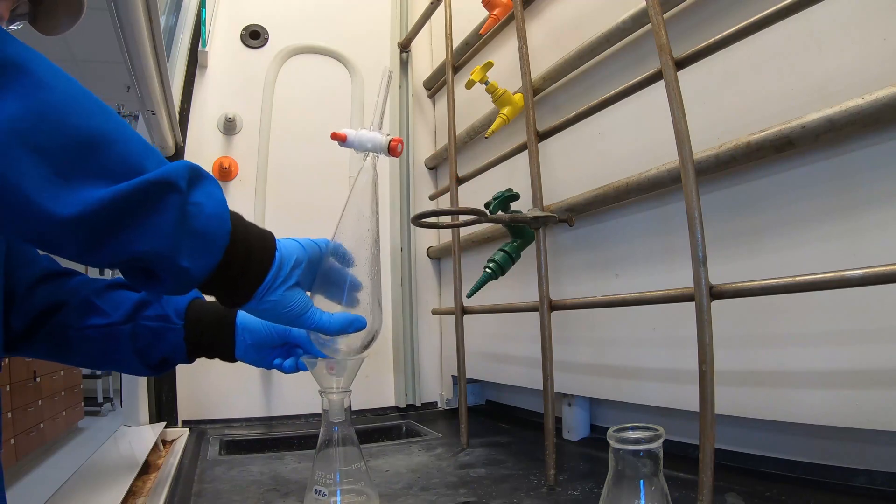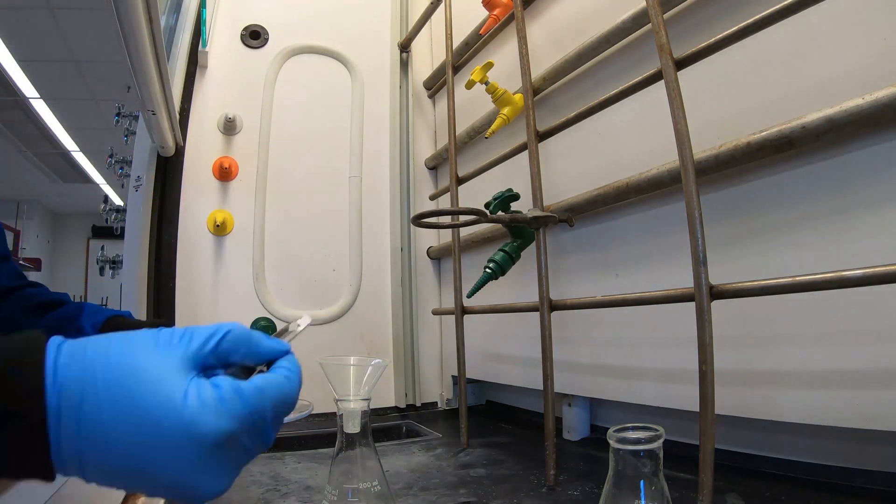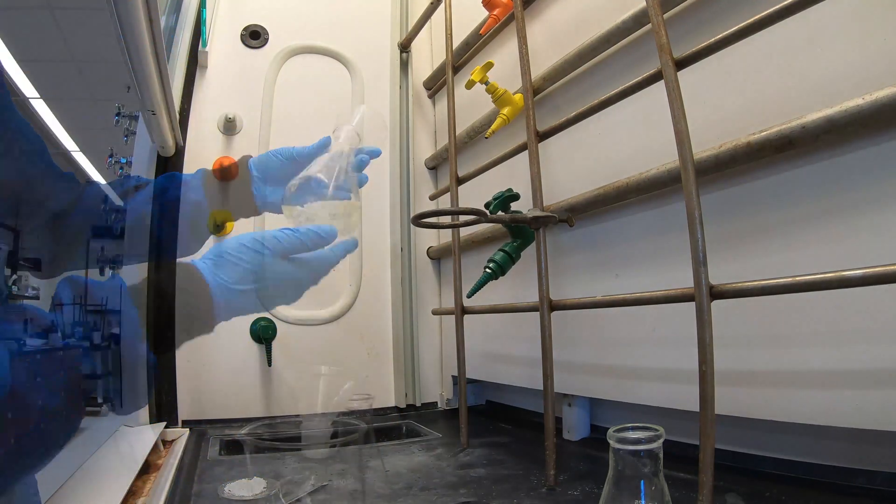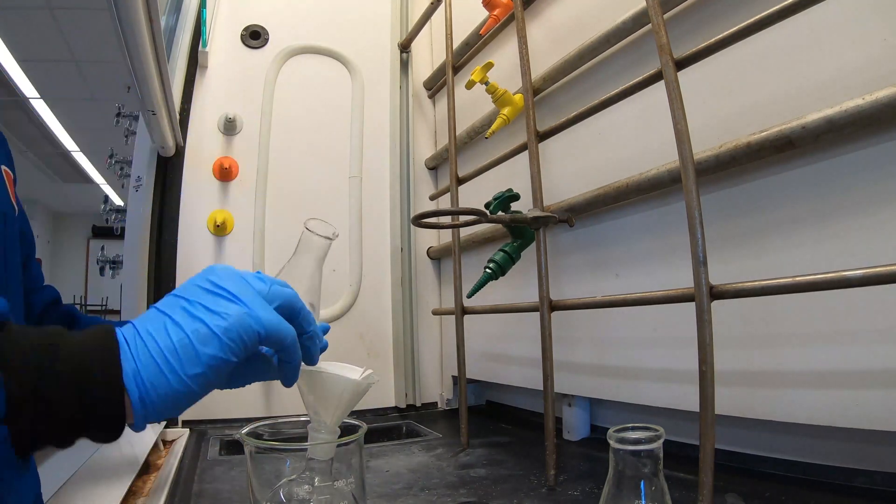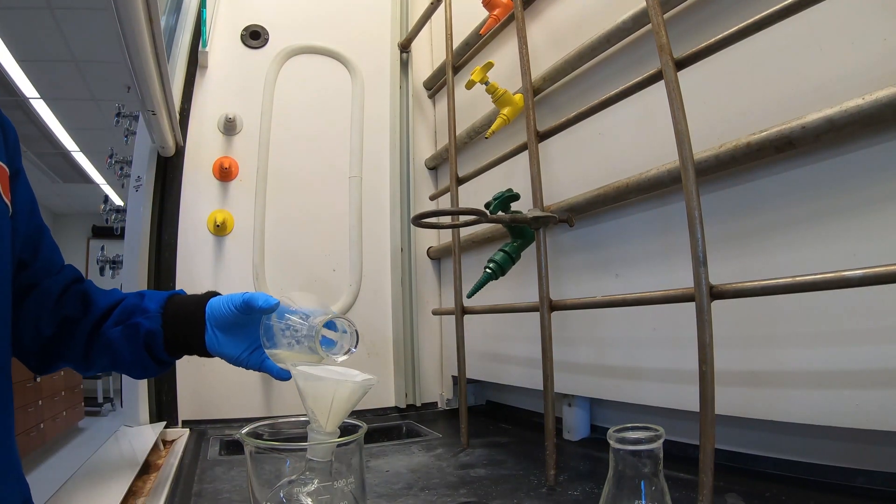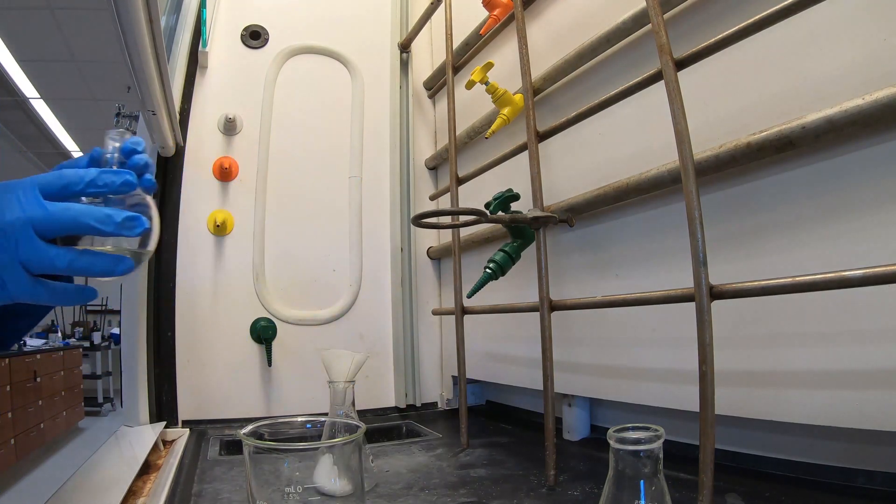Now we're going to dry your ether over magnesium sulfate to remove any lingering water. Once the water is removed, you're going to gravity filter off the magnesium sulfate from your ether. Filter into a 250 ml round bottom flask. We'll then remove the ether from your crude DEET product by using the rotavap.